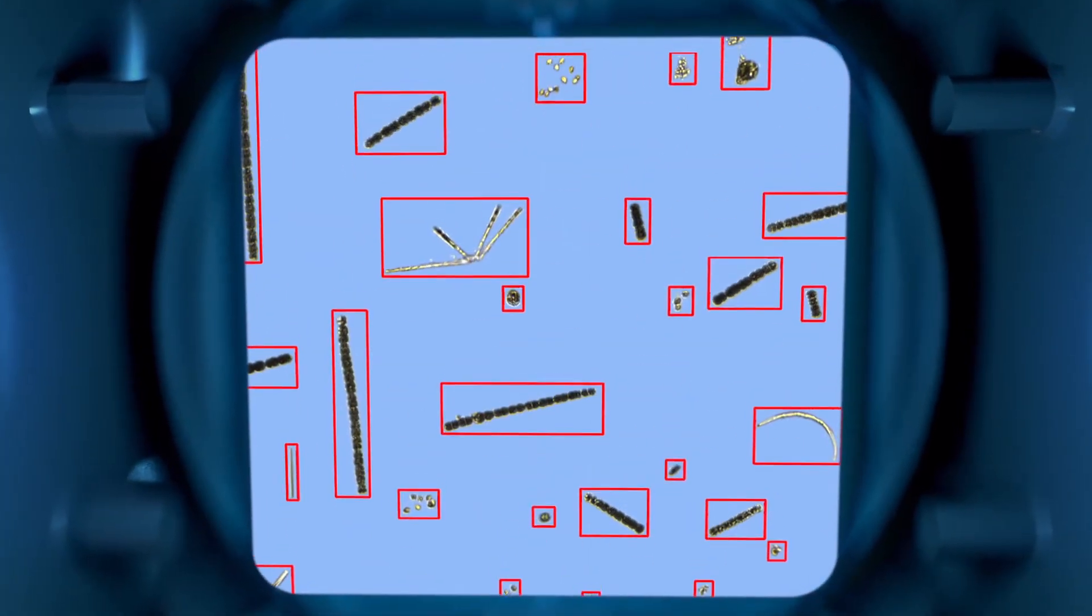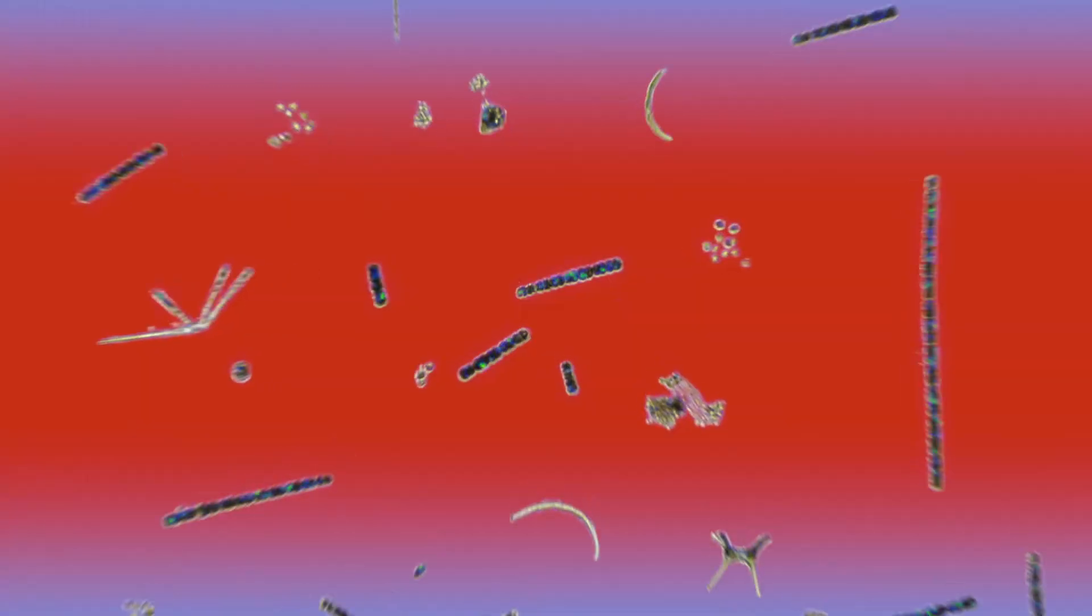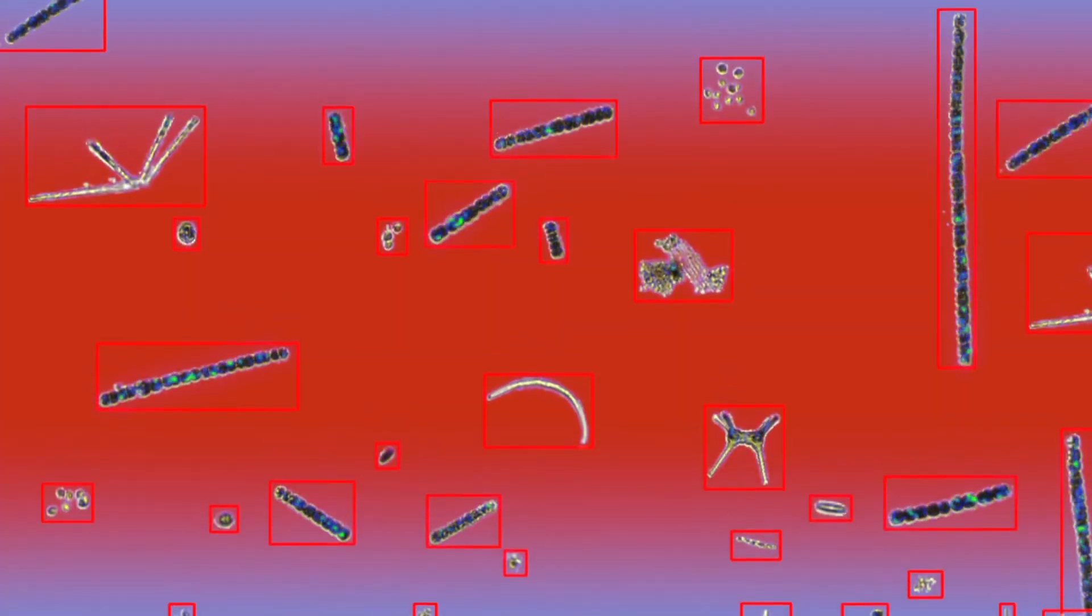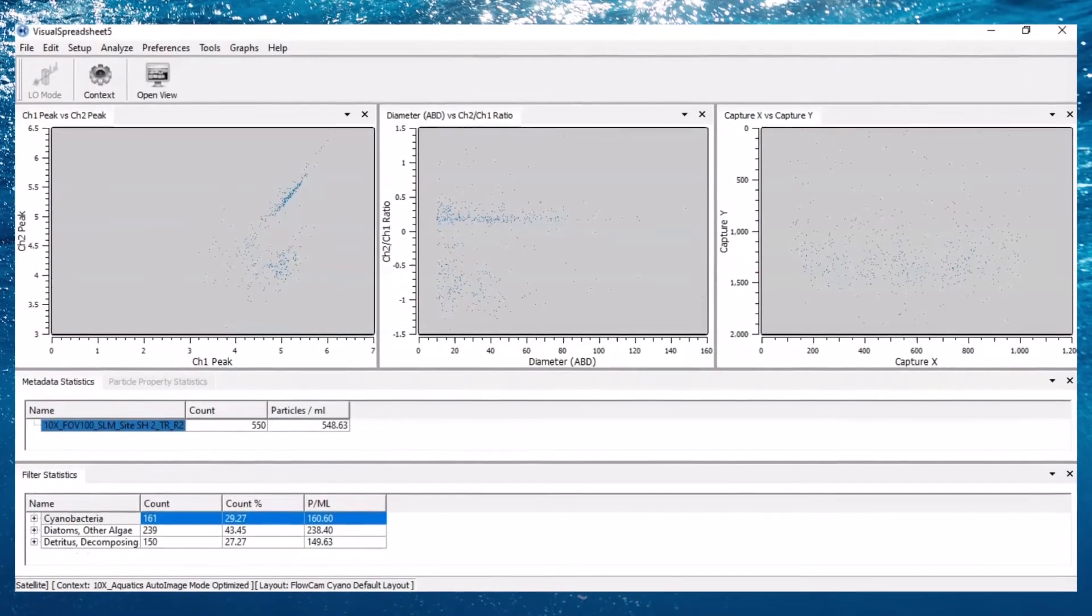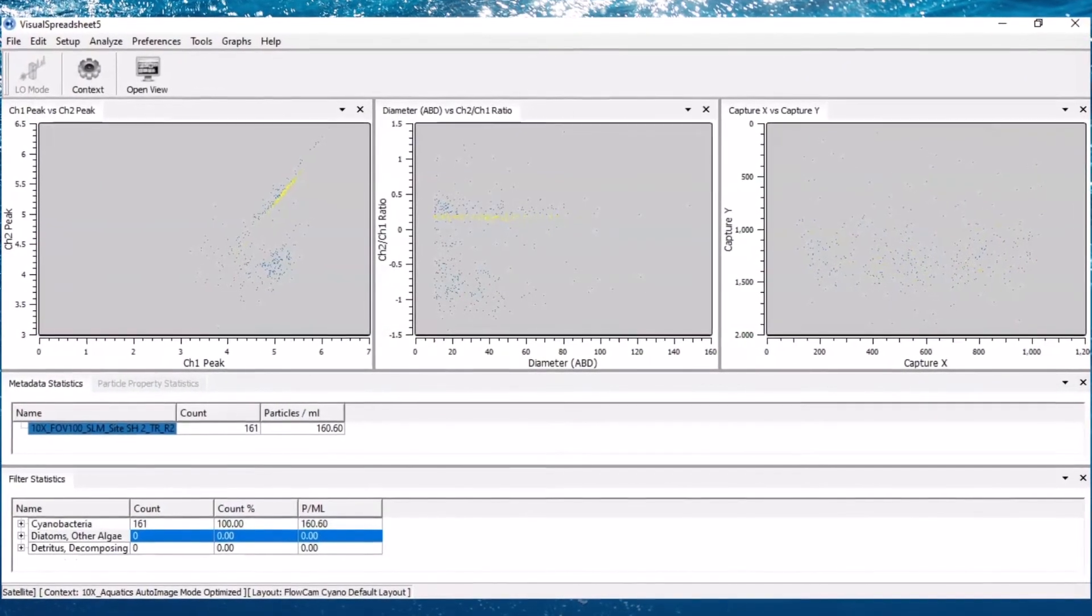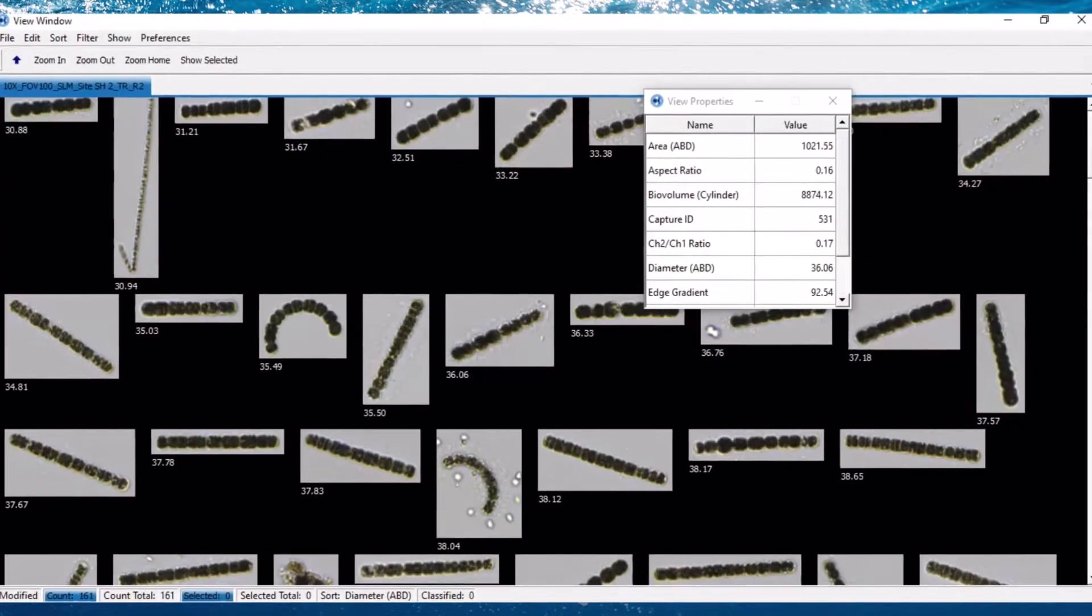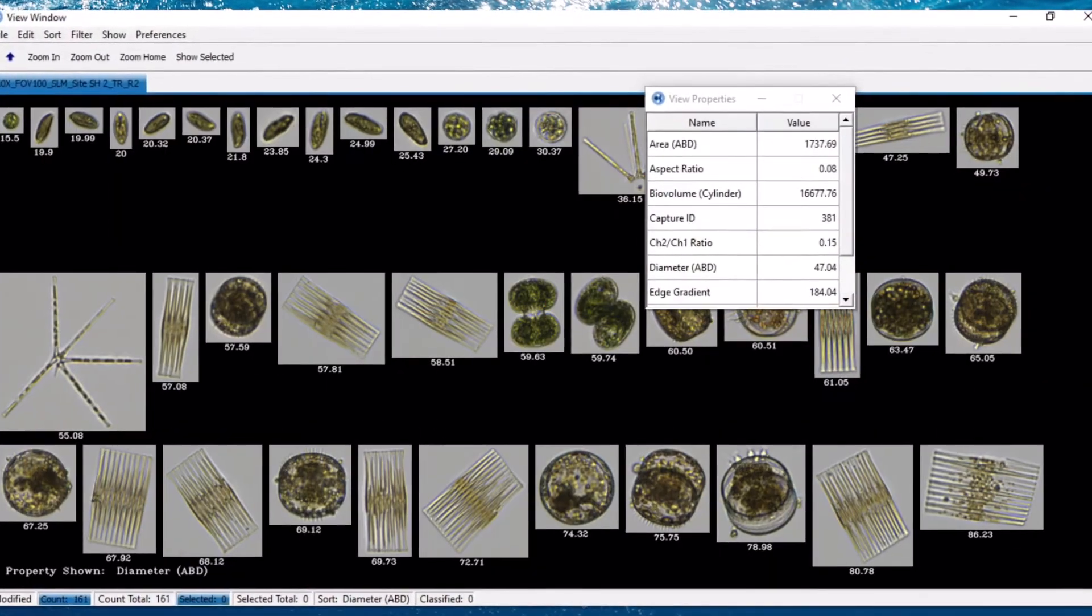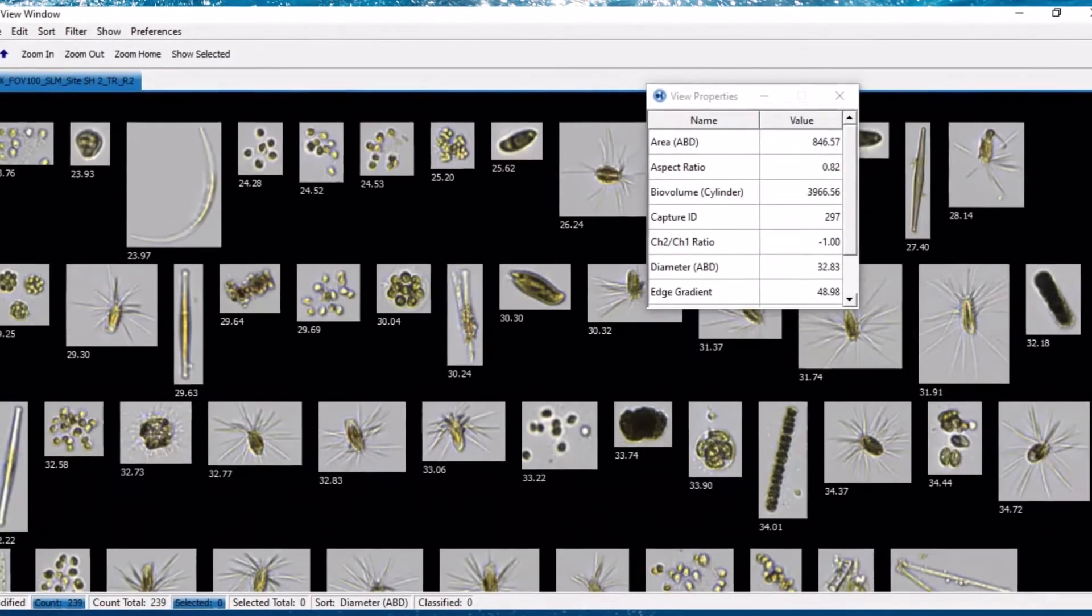Simultaneously, an optional onboard laser excites fluorescing pigments present in specific organisms, enabling the FlowCam to automatically distinguish between groups such as cyanobacteria, diatoms, and other types of algae.